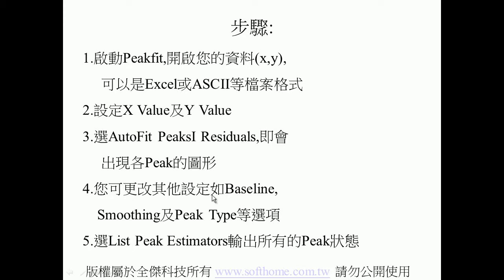Fourth, if you want to set up some parameters, or you want to remove the trend, or you want to smooth, you can use this option. And fifth, finally, this is your PeakFit estimator and outputs to your report.